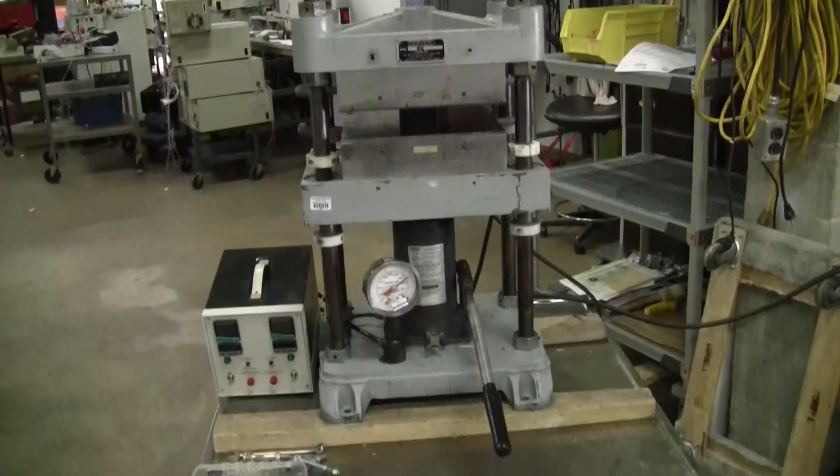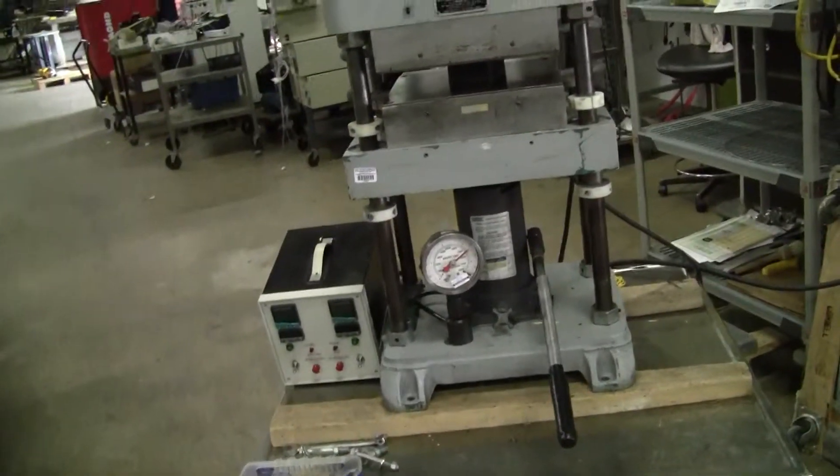Good afternoon, this is Michael Naitow from HitechTrader. Today we're looking at the Carver Press before it ships out.